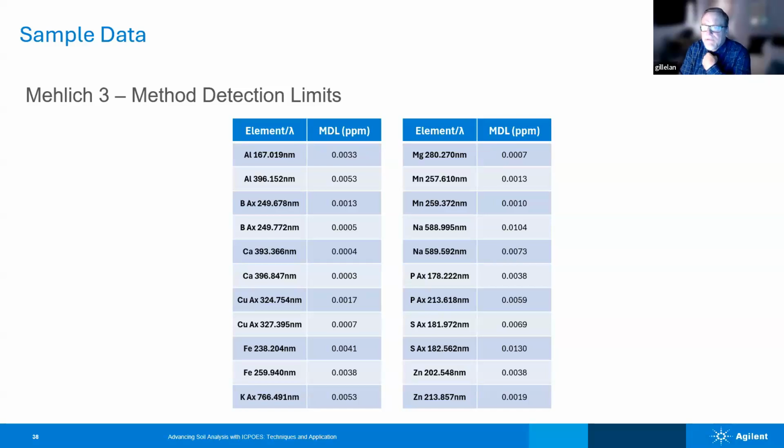Well, and I think in a lot of our labs, we struggle with phosphorus. There's so much phosphorus in soil, we're nowhere near the detection limits a lot of times. But for some of our micronutrients, aluminum, manganese is a great example, those sometimes can get pretty low. So understanding where that detection limit is is a key question that sometimes we don't jump onto.